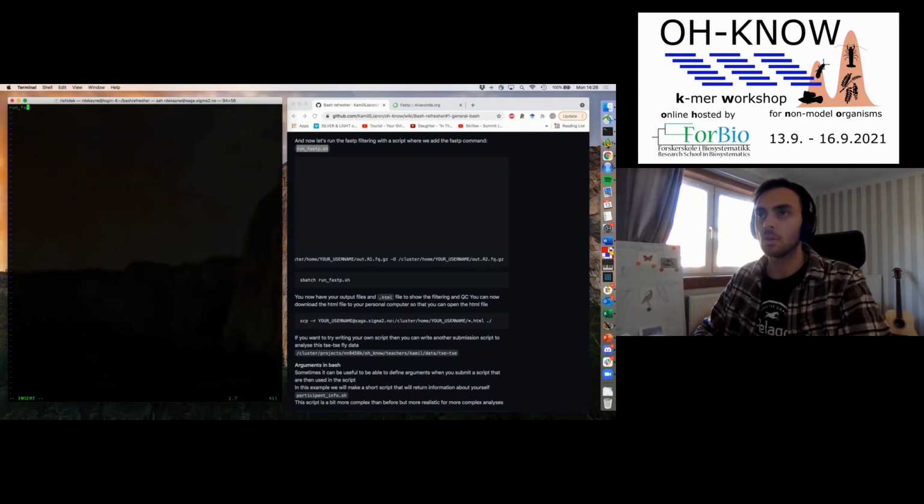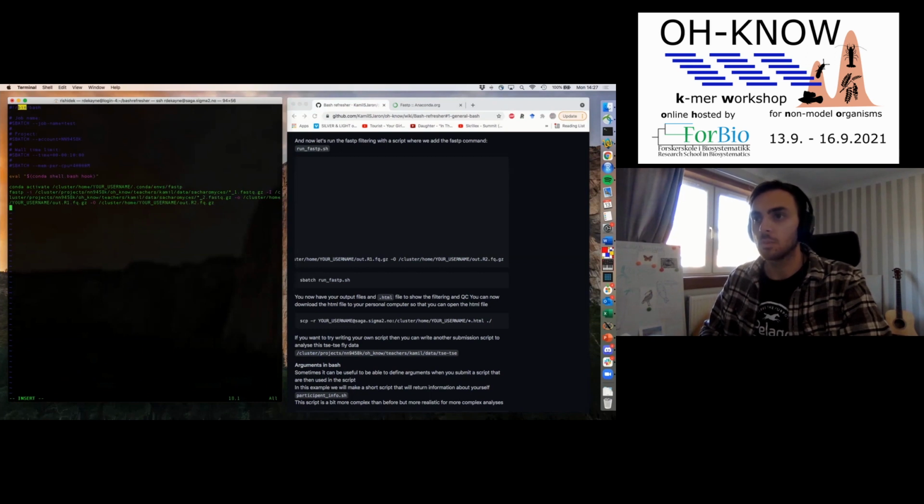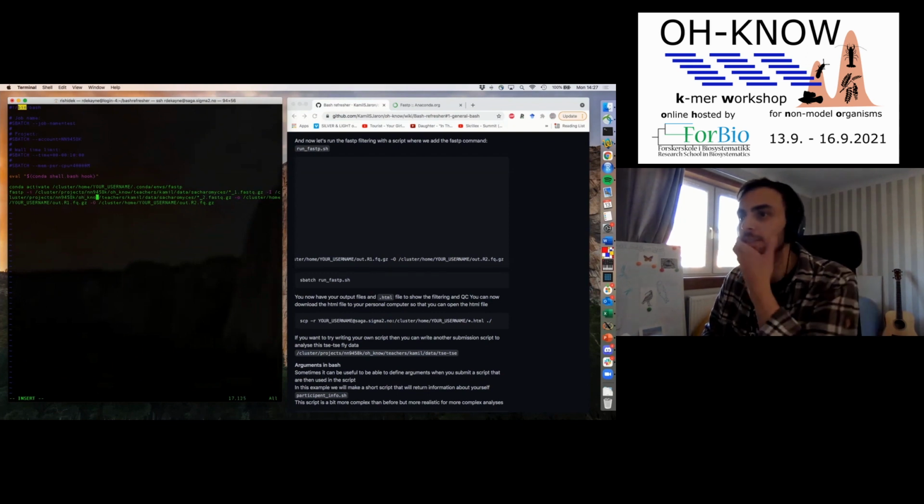And all of you who are familiar with clusters know that obviously you can replace any of these file paths with any other file paths, which can obviously be very useful. So I'm just going to go through this and make sure all of the username stuff is correct before I accidentally write it to somebody else's output directory.